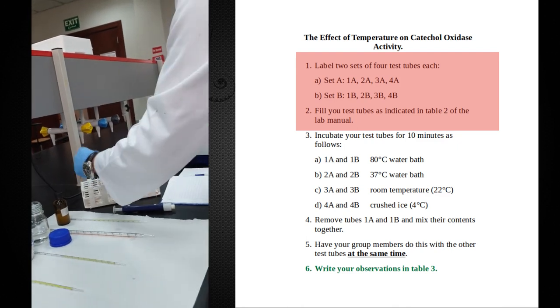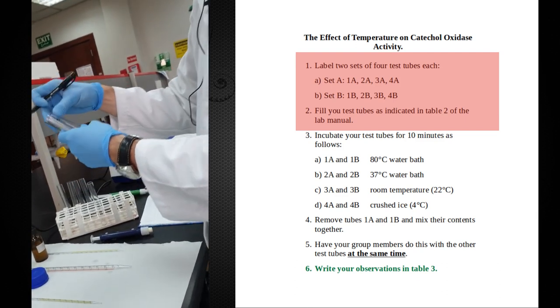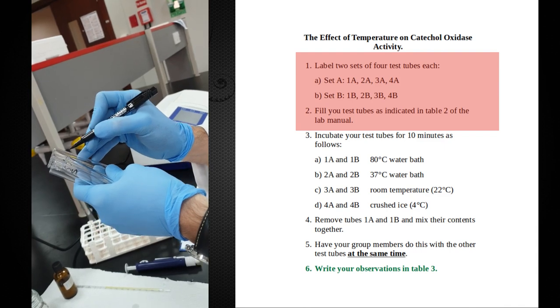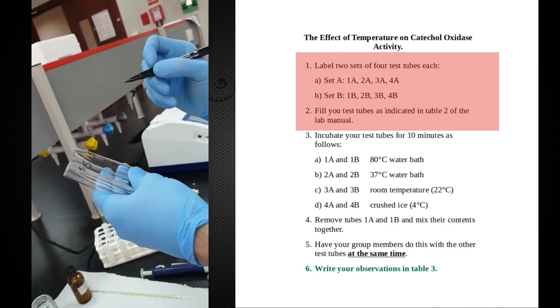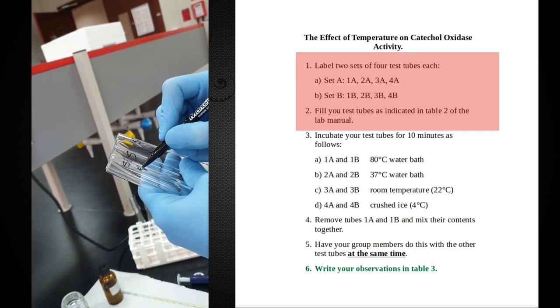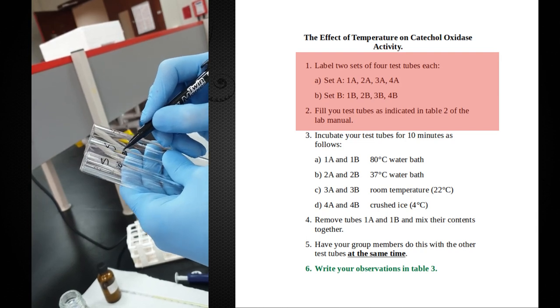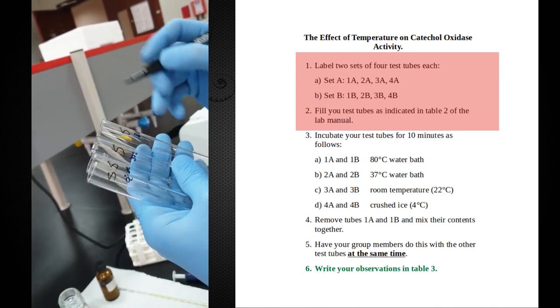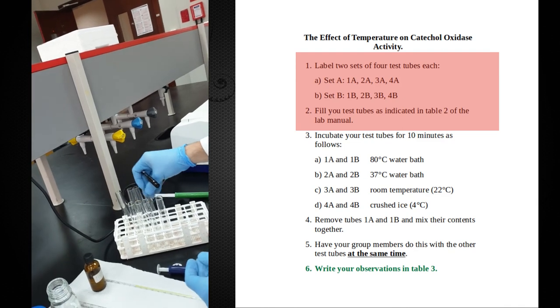I'm labeling these as S for substrate and writing the temperature each will be incubated at: 0°C, 20°C, 37°C, and 80°C. All these tubes are exactly the same — they're just going to different temperature settings. Now I'm going to set up the other set of four tubes with the enzyme.